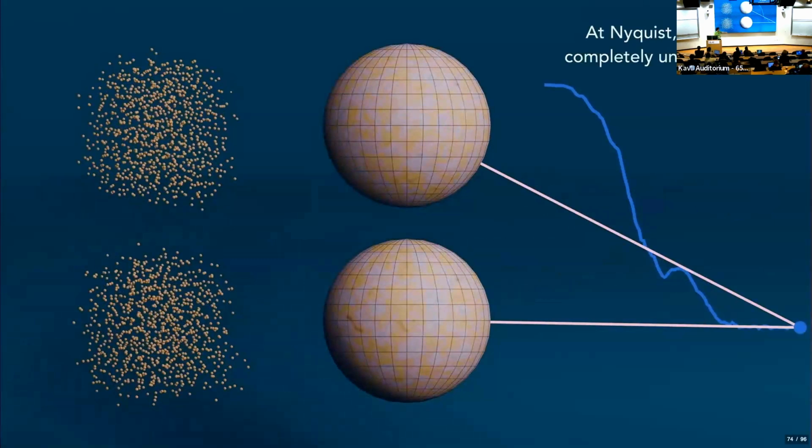Okay, this is called the gold standard Fourier shell correlation, or GSFSC, where you have these half sets, you make the half maps, and you compare them. People will often quote the GSFSC resolution, which is the resolution or frequency at which the two half maps correlate at 0.143. There's a reason for that number that's not really worth getting into. Just know that if someone tells you, oh yeah, it's a 3 angstrom map based on the GSFSC resolution, that means they split it apart, they made these half maps, and then when the line crossed 0.143, that was at the 3 angstrom mark. Okay?